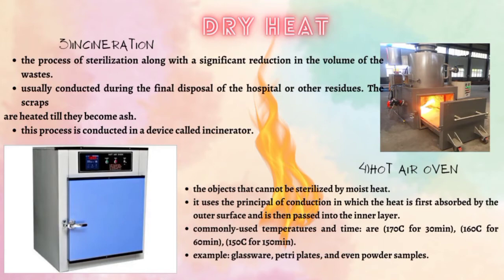Fourth, hot air oven. It sterilizes objects that cannot be sterilized by moist heat. It uses the principle of conduction, in which the heat is first absorbed by the outer surface and is then passed into the inner layer.